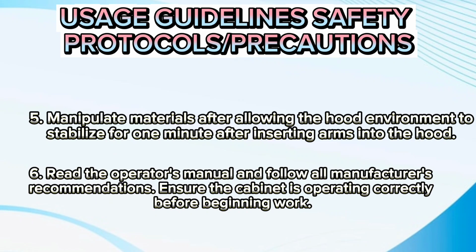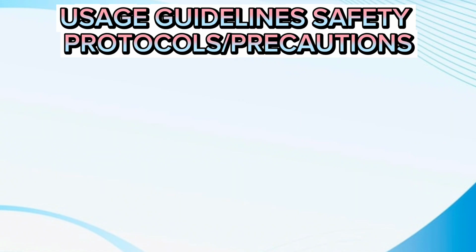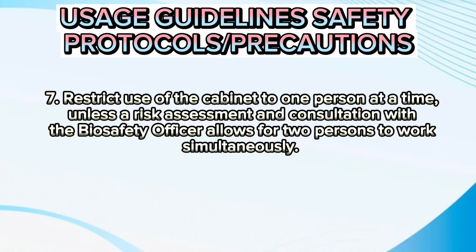Next, read the operator's manual and follow all manufacturer's recommendations. Ensure the cabinet is operating correctly before beginning work. Lastly, restrict use of the cabinet to one person at a time, unless a risk assessment and consultation with the biosafety officer allows for 2 persons to work simultaneously.